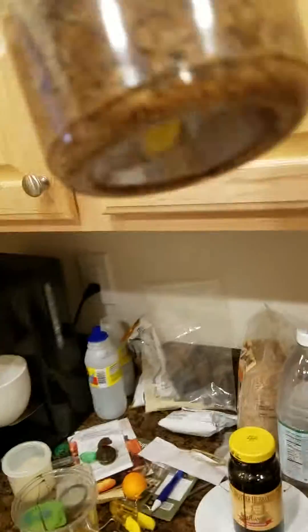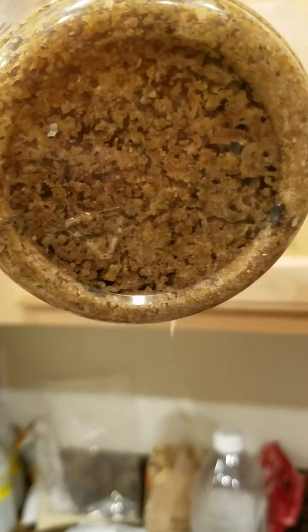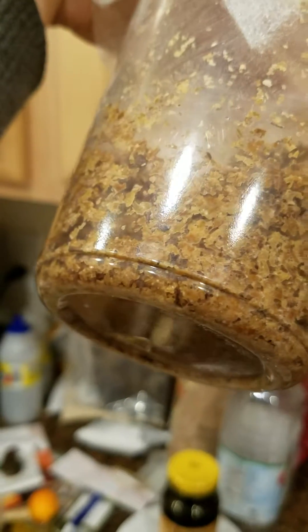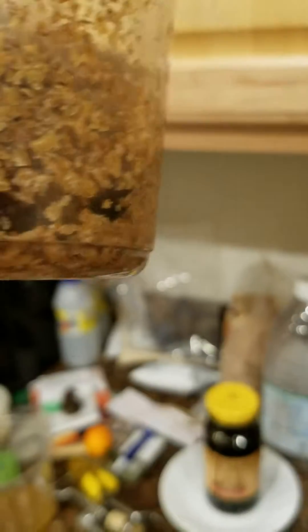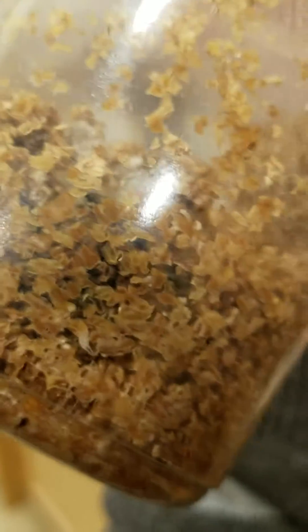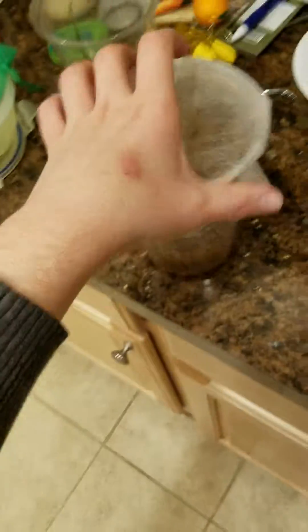Following up on our housefly breeding. If you can see in this container, if you look closely you'll see that there are some young housefly larvae — there's one. They're developing quite well in here. If you look at this container, however, it's just loaded with larvae.